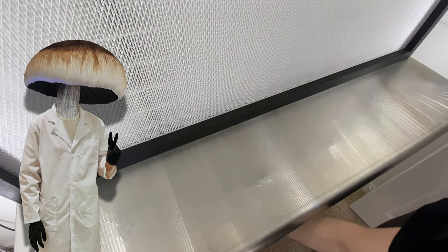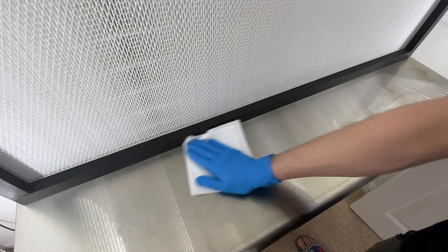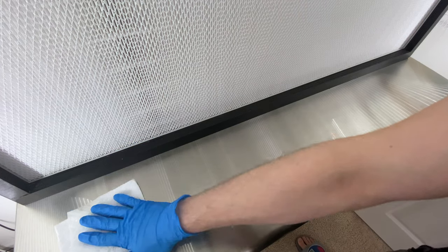Hello Internet! Thanks for joining me again in another video. We're going to be going over how to take clones or actual tissue from a fruit and start the mushroom growing process by using petri dishes. I want to emphasize that this process can be used to clone any kind of mushroom, whether gourmet or medicinal.